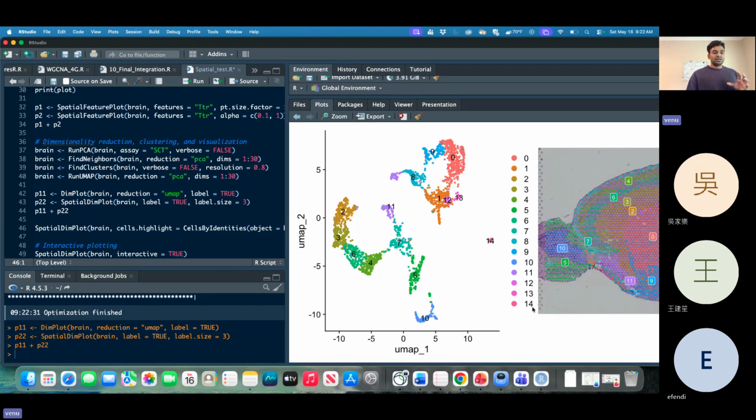So within the 15 spots, there may be two more, or maybe four, two more groups. That is where most single cell and spatial analysis, they want to see, for example, this 4, this is a CD4. So again, CD4 highly associated with some marker. So they report, yeah, we found this particular CD4. So again, we subdivided into CD4 like marker. They usually assign marker name plus CD4, then marker name plus CD4.